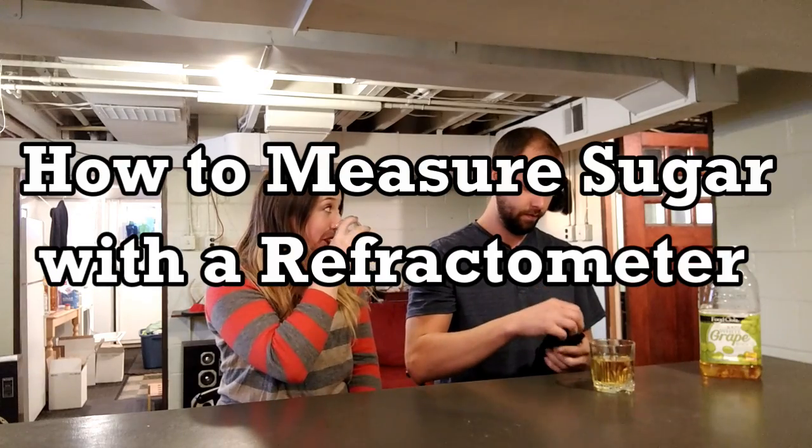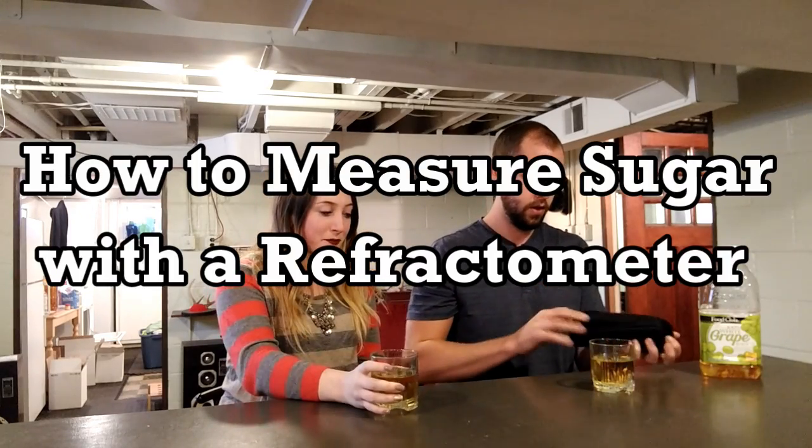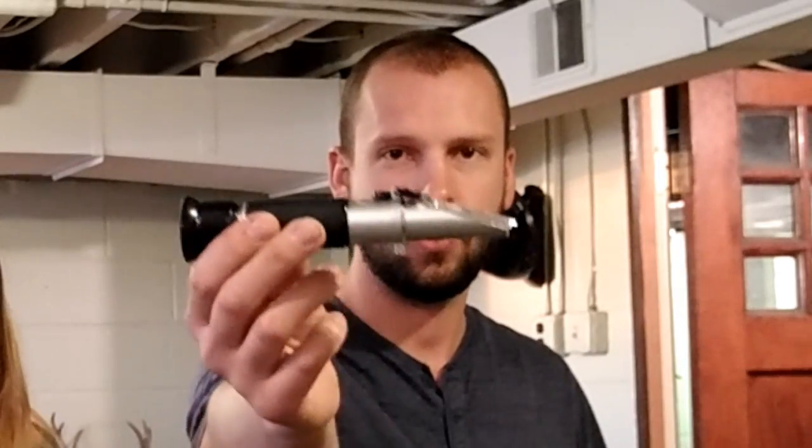I wonder how much sugar is in this juice? I don't know. Let's find out. Okay. So if you're wondering how much sugar is in your juice, a quick and easy way to find out is to use this little gadget — a refractometer.